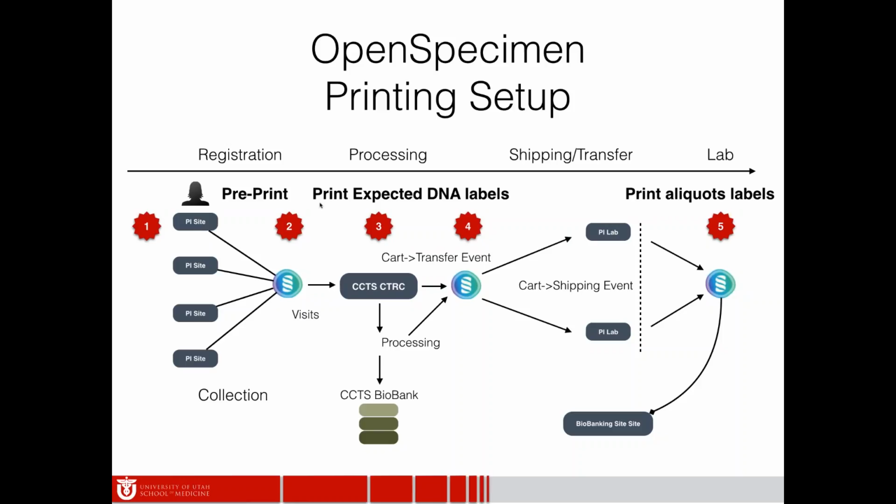So it's not the number of samples, it's the number of users and the setup. This is the Utah Children's Project, which was an offshoot of the National Children's Project for following kids through development. They have a lot of samples, and a long time to track these kids. So we have 20 events over 20 years where they're capturing samples.